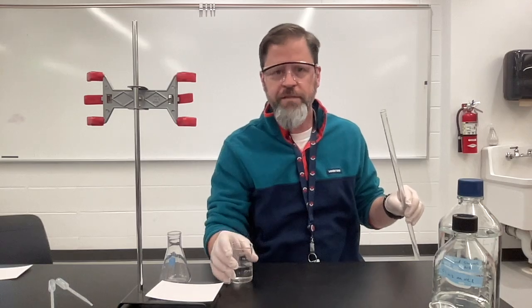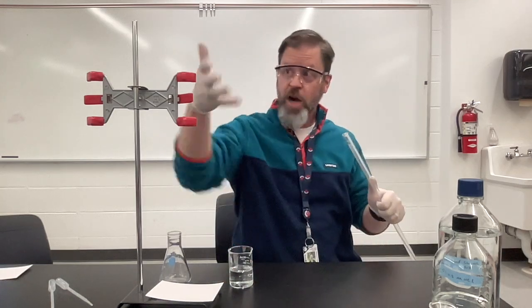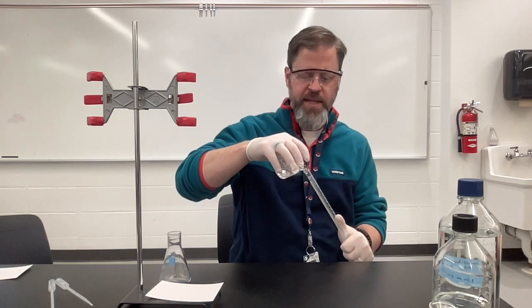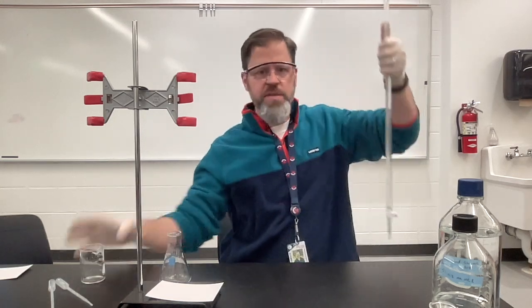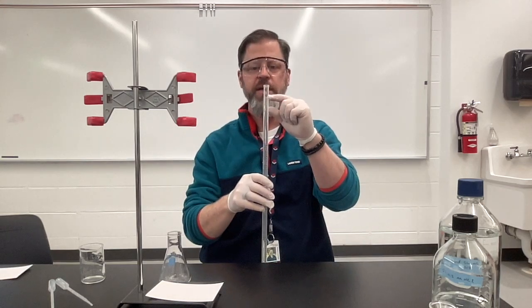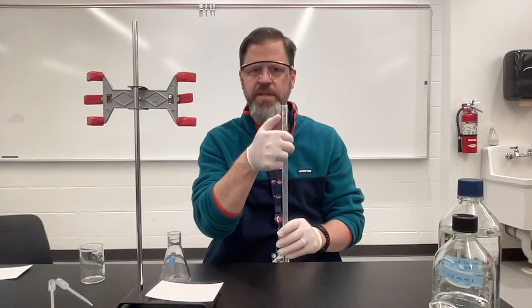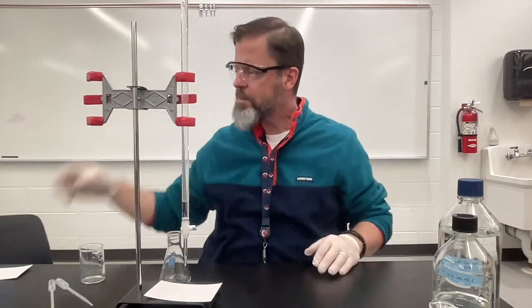To properly do this, you want to have something that you can pour very effectively with, so I have a beaker with a nice lip on it. I'm going to take the burette off the ring stand and start pouring very carefully and slowly. If you pour too quickly, you can spill, especially with tricky chemicals. It is considered best practice to get the titrant very close to the top so you have a lot to potentially use, but don't try to nail that mark right at the top. It's considered more accurate to just pour to wherever you get and then make a measurement after that.